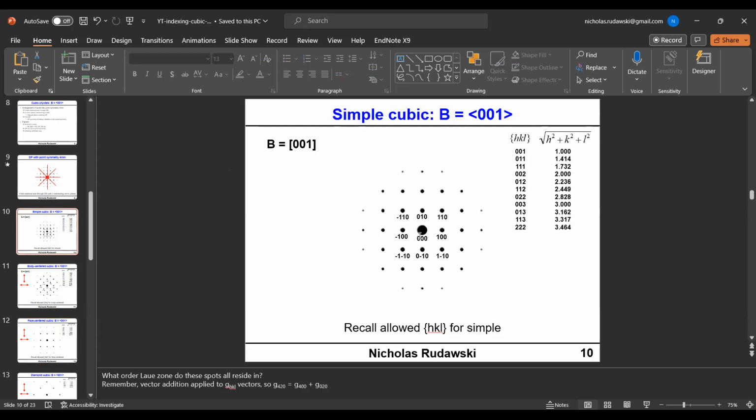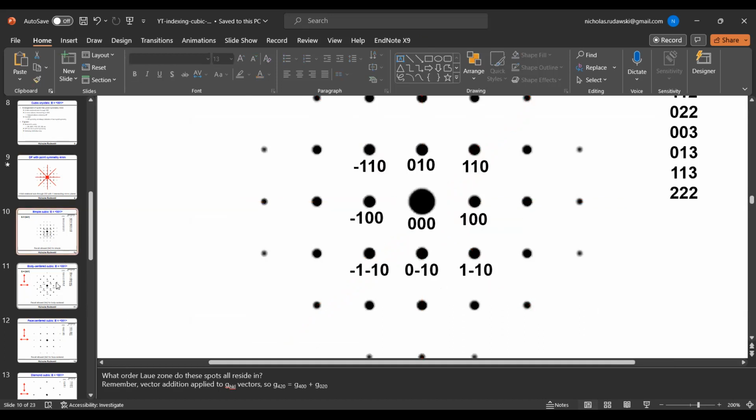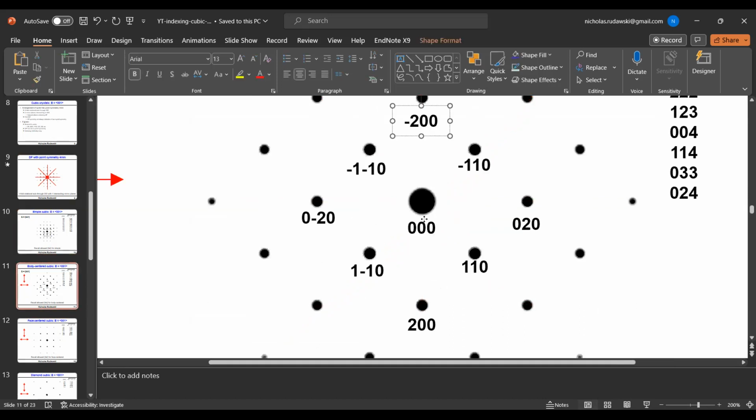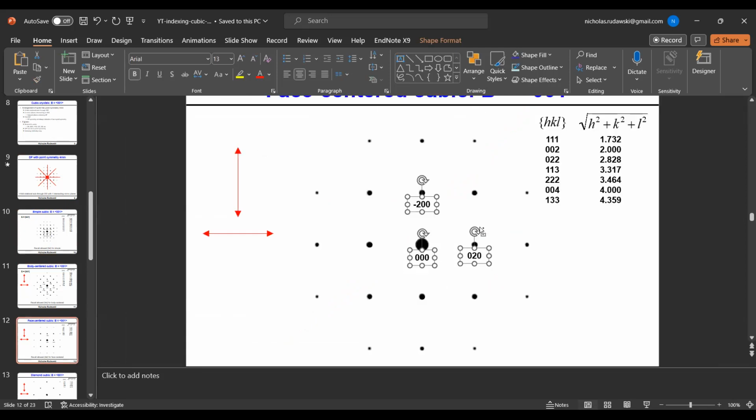Okay, so let's go ahead here. Okay. All right. So we know that's 0, 0, 0, okay?